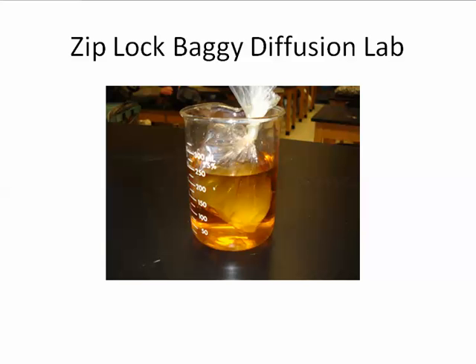So the lab goes like this. You're going to take a Ziploc bag and pour some starch into it. You're going to pour some glucose into it. Seal it up, and then you're going to place it in a beaker of water that you've added some Lugol's iodine to.